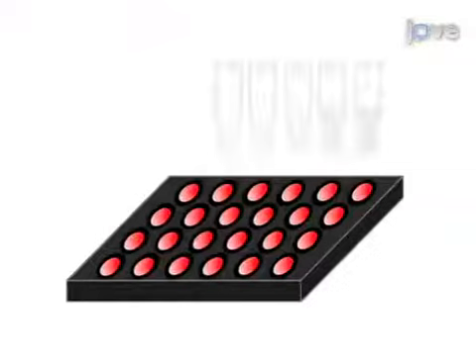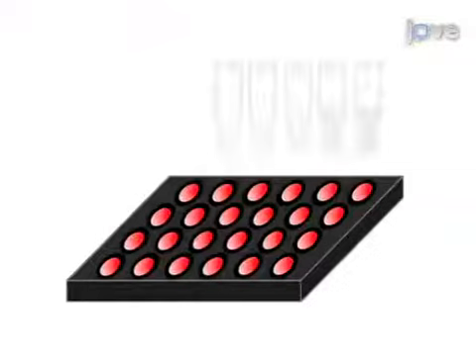In the second step, equal numbers of cells are seeded into individual wells of a multi-well plate. Next, the cells are treated with a compound of interest over a range of concentrations.